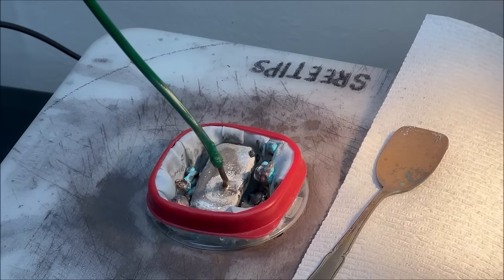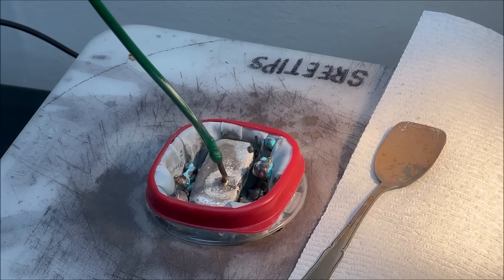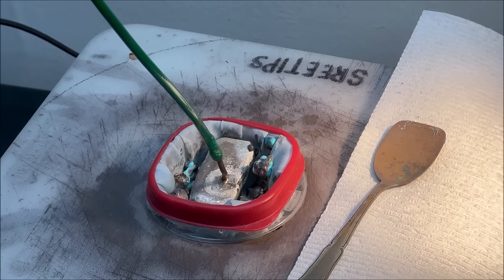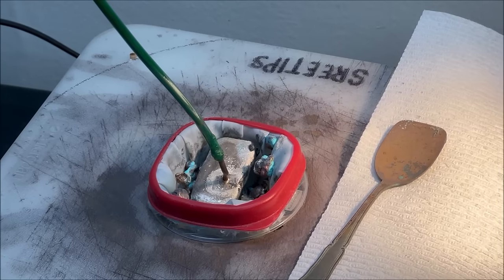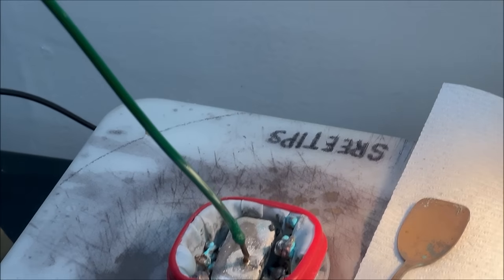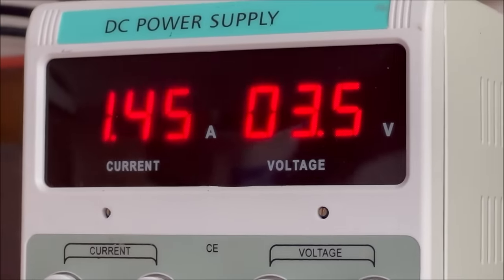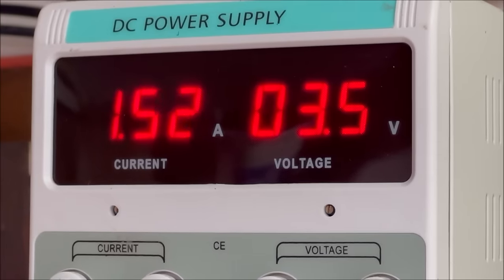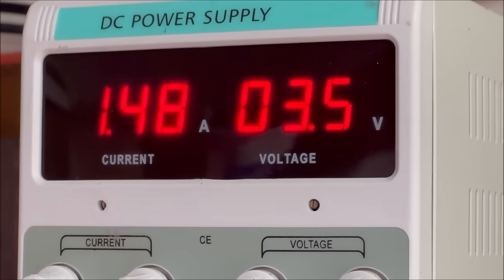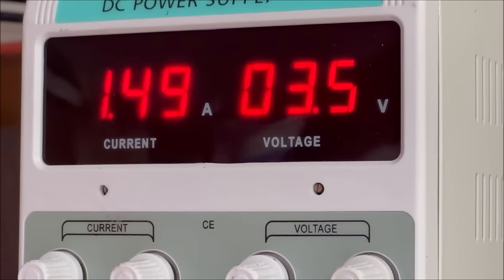Here you can see the silver in that anode filter basket has collapsed, just by me picking the lid up like that to look inside the cell. And when it does that, more silver comes in contact with the electrolyte, and the amps jump up. It went from 0.5 up to 1.5.